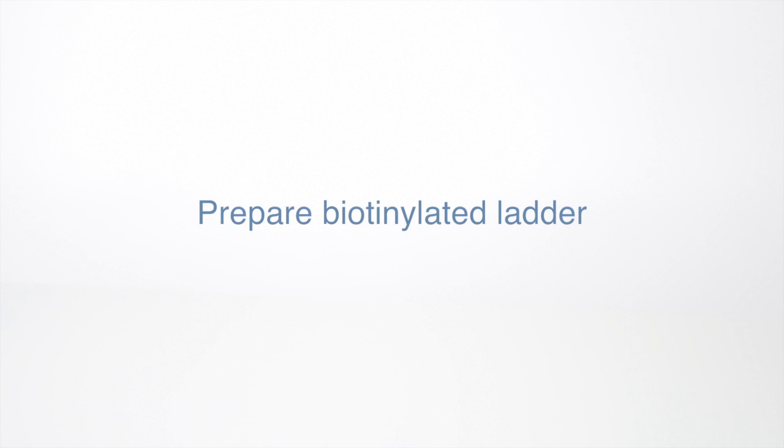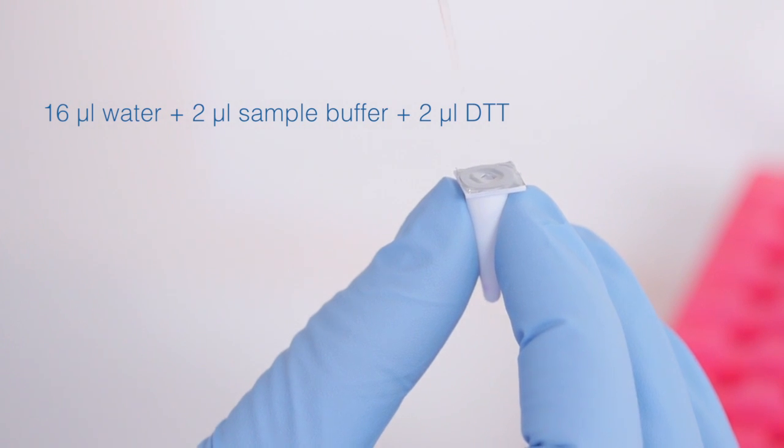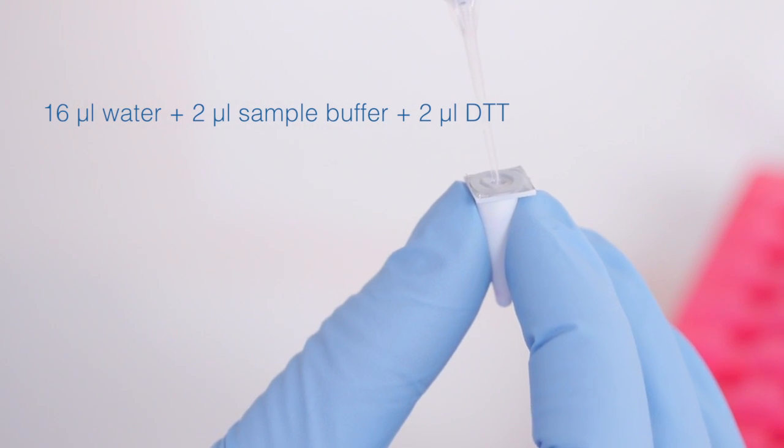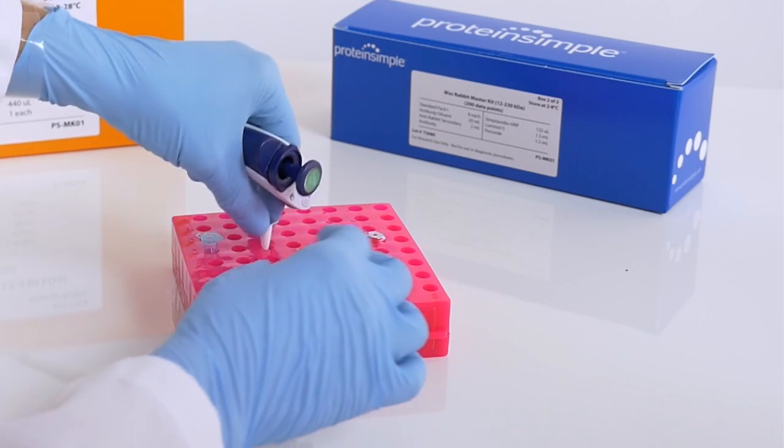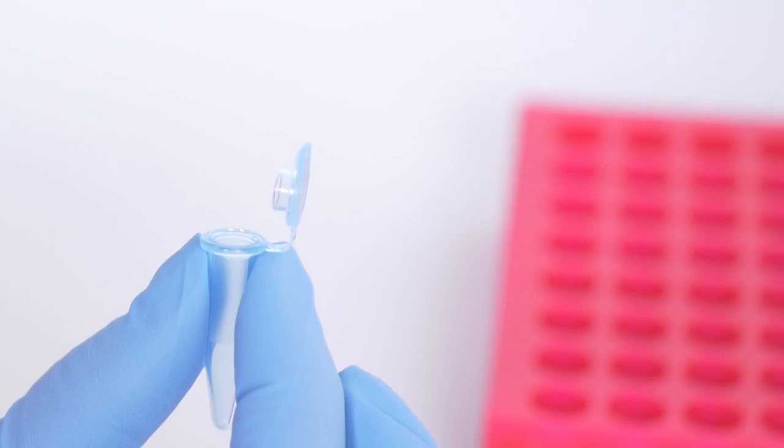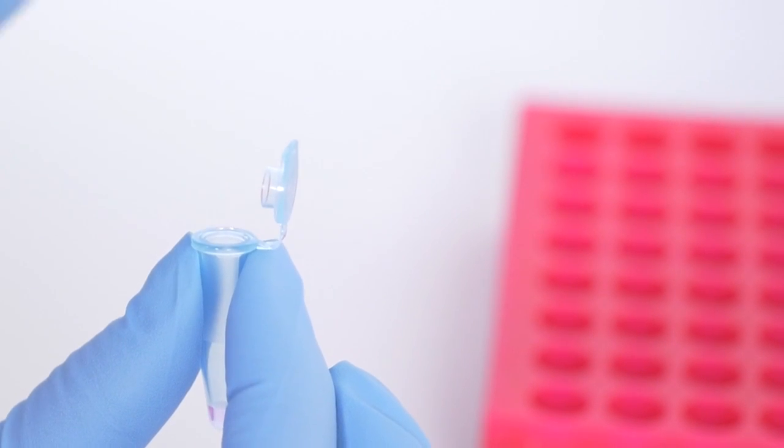To prepare the biotinylated ladder, grab the white tube and add 16 microliters of deionized water, 2 microliters of 10X sample buffer, and 2 microliters of the DTT solution we made earlier. Mix and then transfer the contents into the provided blue tube and close the cap.